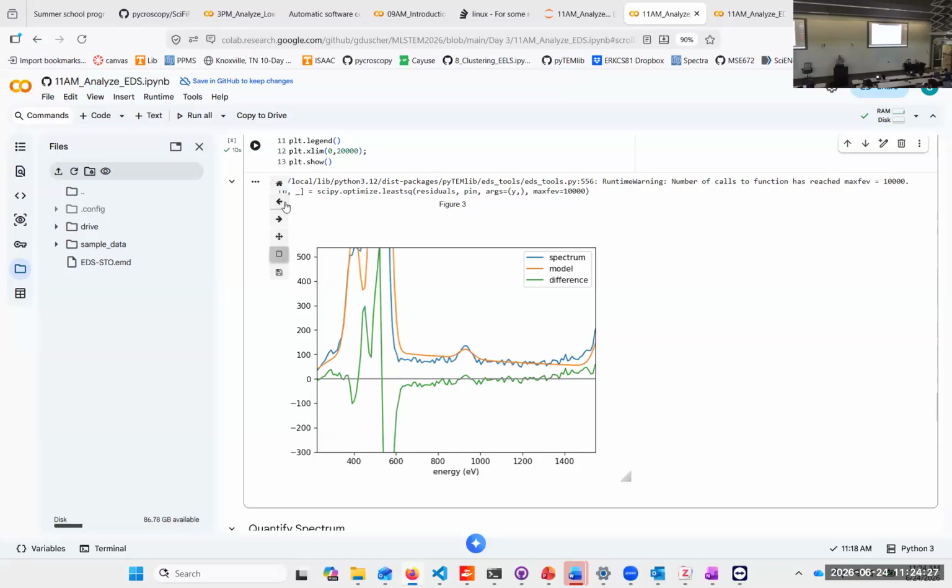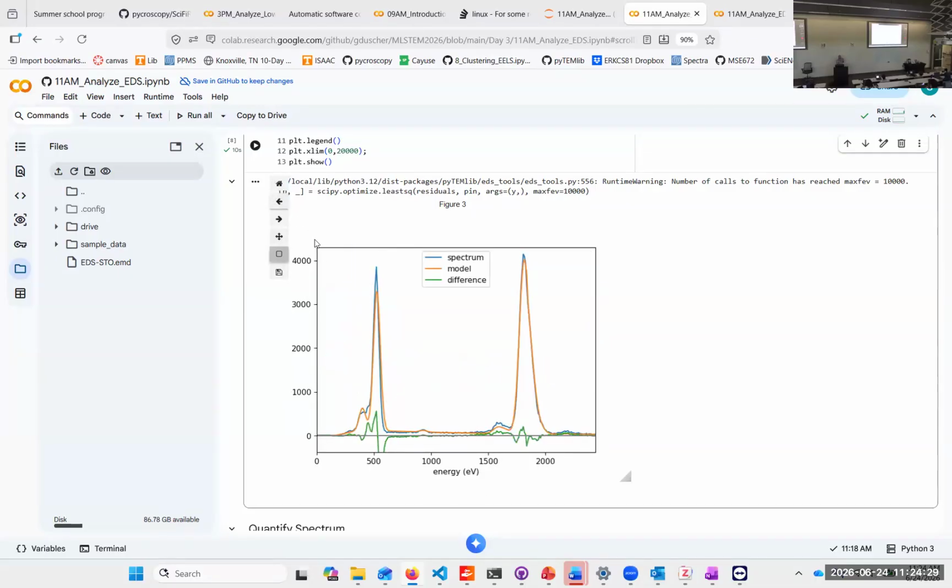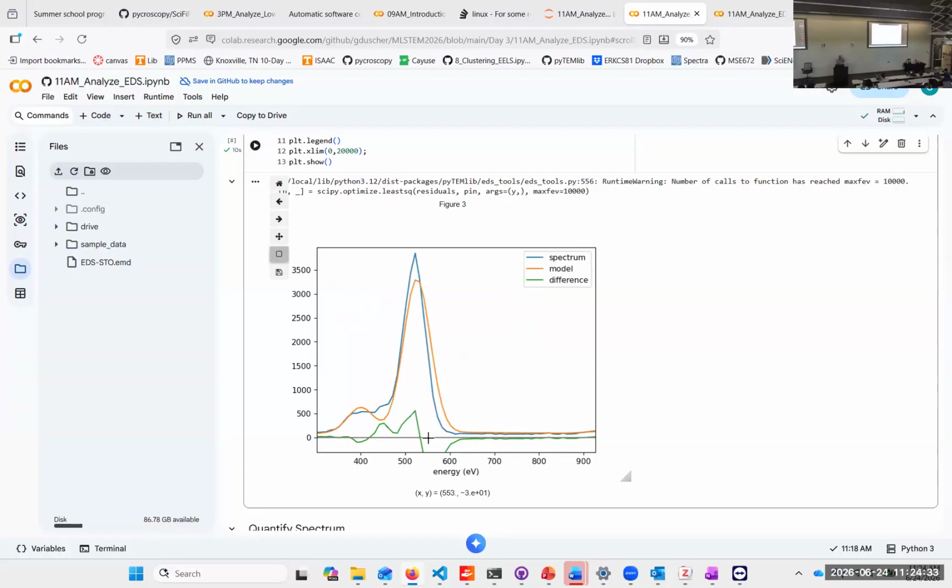So any of these things would change that. The main thing is at small energies, the energy scale calibration is off. That's something I wanted to do, but I thought I don't do that before the summer school, is to let the peaks move a little bit left and right, so that we might be even able to scale the energy with that.